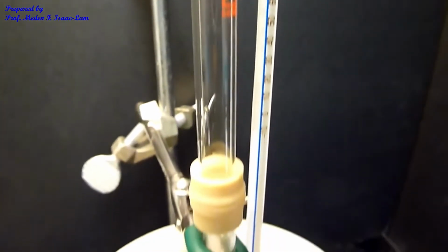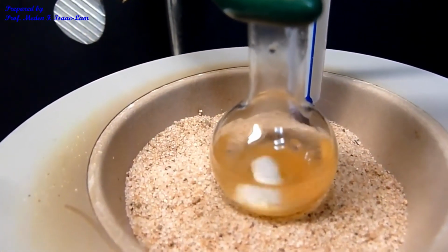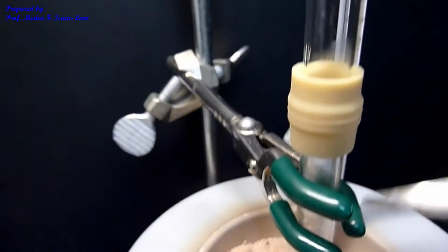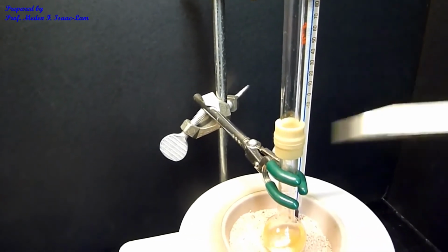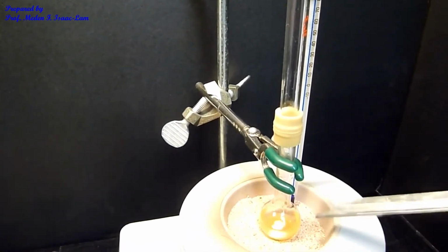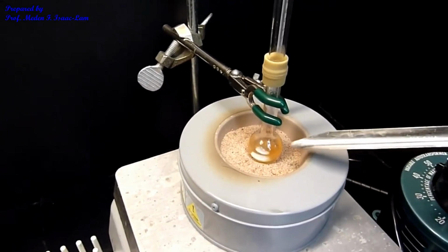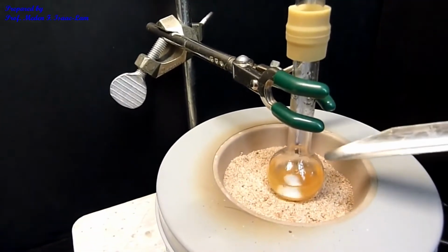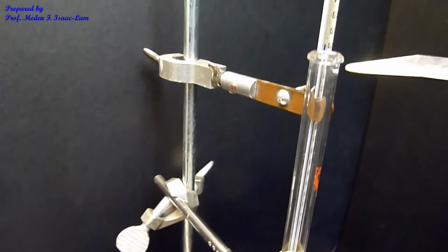So you can see the big bubbles when I'm stirring it, and then we want it to boil. The air condenser acts as a coolant, so it's not going to dry up, and the cold air cools the vapors. It will go down back into the reaction mixture. It's been 20 minutes since I started refluxing, and you can still see the bubbles in here. Again, the evaporation is just around here, and then it's going down, so that's the reflux. Right now the temperature is around 142, which is just right.